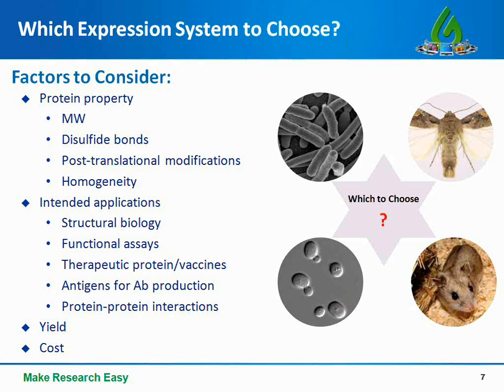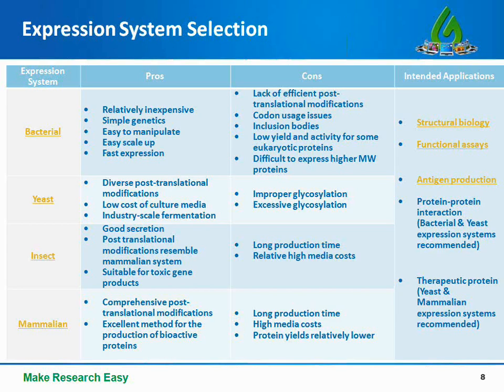As every project comes with a budget, you also need to consider the yield of protein in the chosen expression system and also its associated cost. Keep those factors in mind.